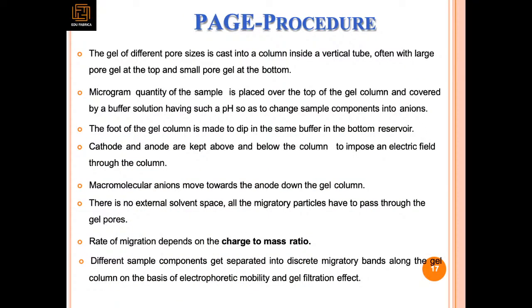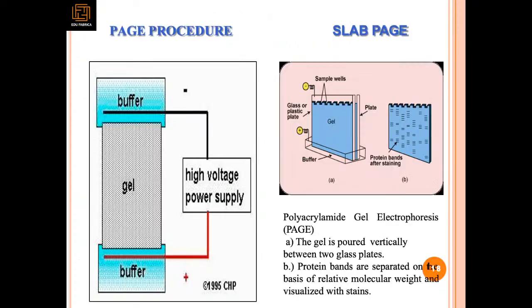In PAGE, we will discuss this later in the Western blotting, as it is part of Western blotting. It is also called PAGE. So we will discuss this in detail in one of the later lectures. But in a nutshell, I can tell.